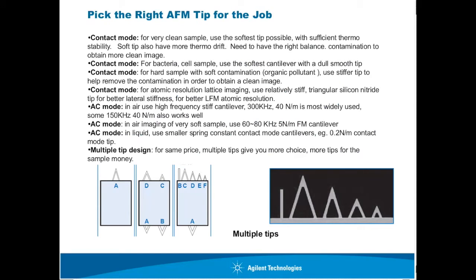Okay, in order to pick the right AFM tip for the job, here are some rules of thumb. I'm not going to read it line by line. You can always download the PDF, and we're going to quickly move on to our next topic, which is how to analyze your sample.